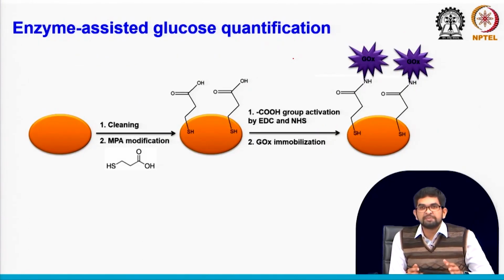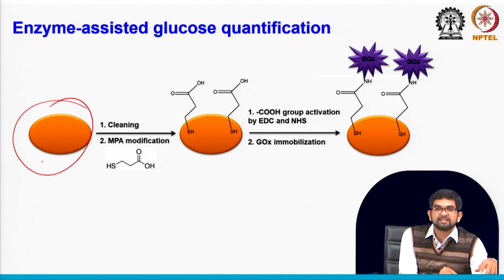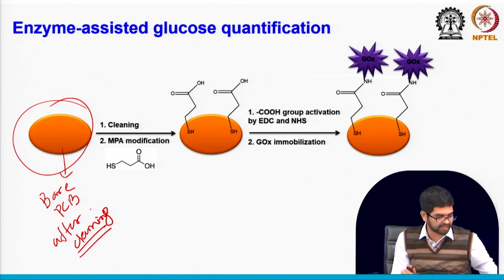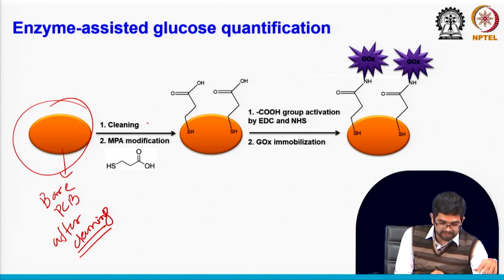Now let's come to PCB based biosensor development for glucose quantification. So your sensor surface is now clean, and it is ready for organic molecule immobilization. You can see this image, this is the bare PCB surface after cleaning. Who does the cleaning, you have to decide, as I already taught you, and check which is the best cleaning method. Too much copper exposure should not happen, you have to keep that in mind. So after the cleaning, let's use MPA, mercaptopropanoic acid.